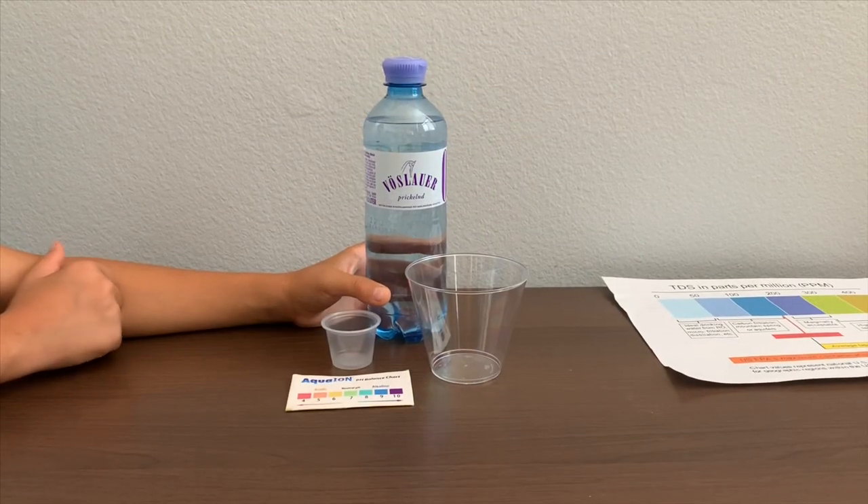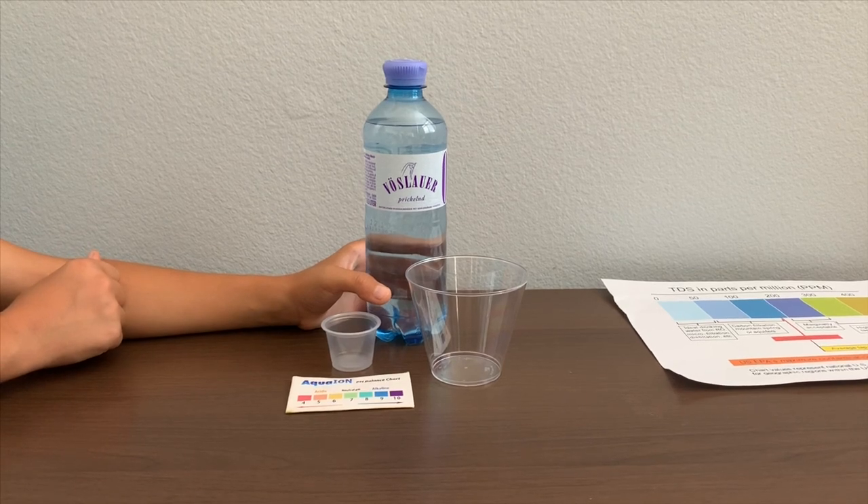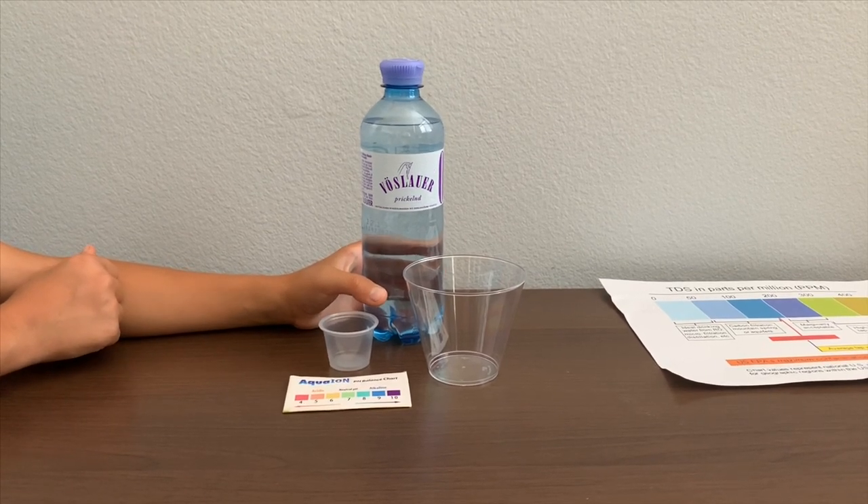This is well-sourced sparkling natural mineral water. We bought it from the Austrian airport. Let's test the pH and TDS levels.